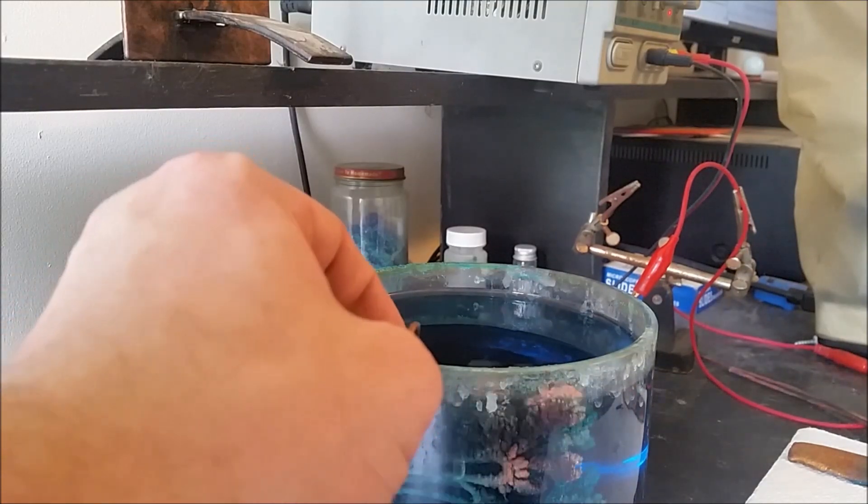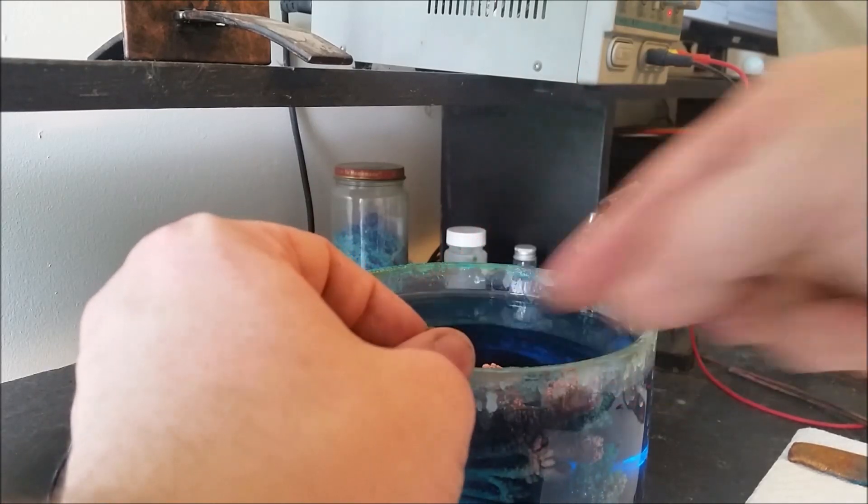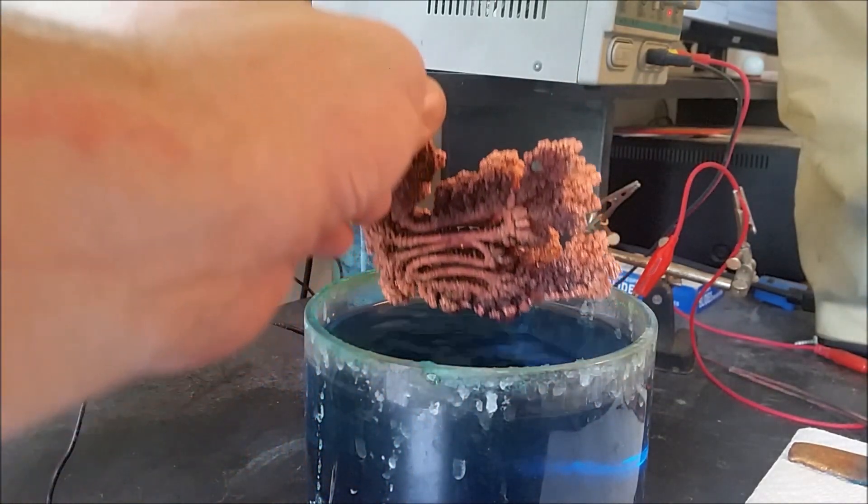Now this part always makes me nervous because oftentimes they are really brittle and often break off and fall into the bottom of the solution. I'm going to try to avoid that.